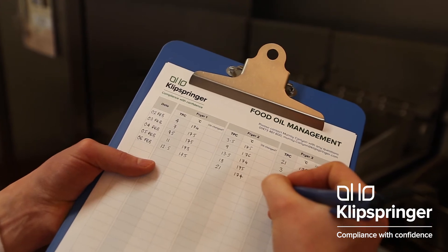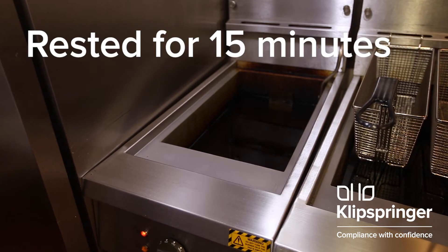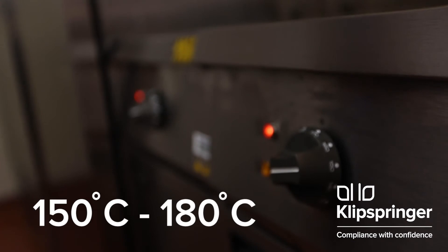It normally works best to check your oil quality at the end of a day's trading. The oil must have rested for at least 15 minutes since the last batch was cooked, and be between 150 and 180 degrees Celsius.